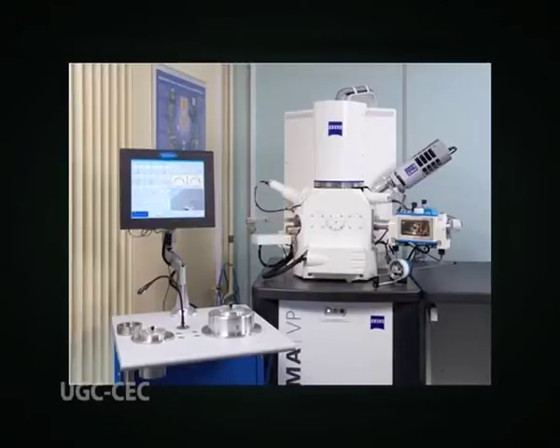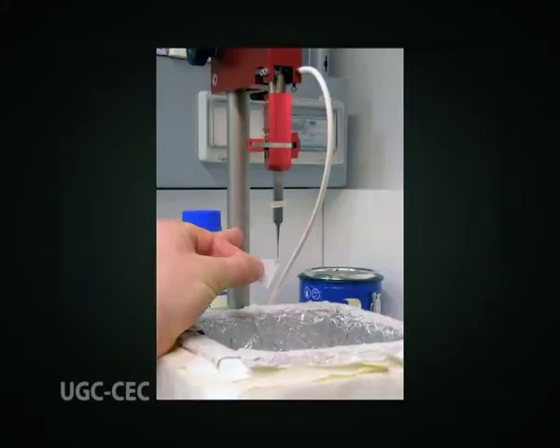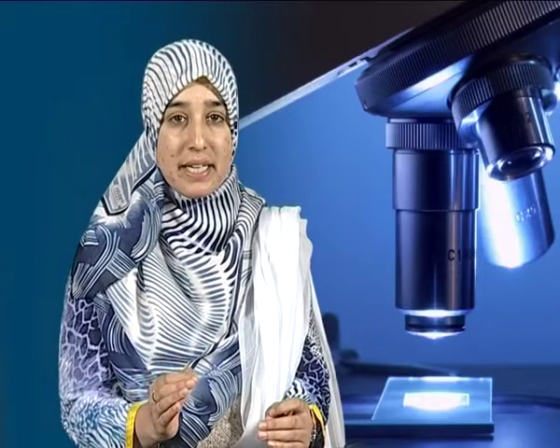Direct observation of the ice crystals of frozen samples without prior thawing is done by cryo-scanning electron microscopy. Cryo-scanning electron microscopy involves an additional step of coating with metal for enhanced conductance of the electrons. The frozen specimens prepared for cryo-electron microscopy are not replicated but are immediately transferred to a low temperature stage within a microscope and viewed directly.